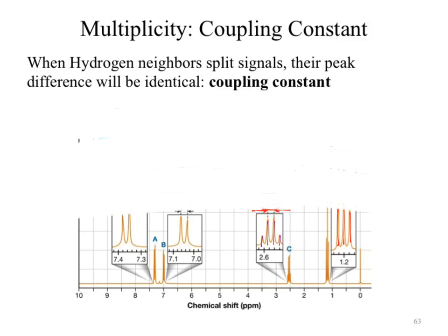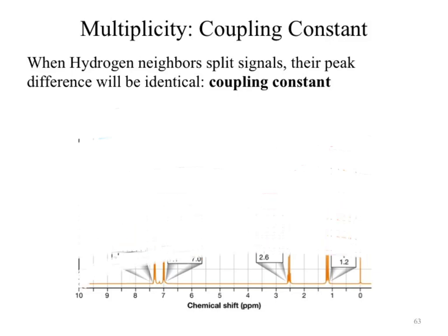Where it becomes really important is if you wanted to distinguish between, give me a sec here, erase this. What is the difference between these 2 signals? We're going to end up with the same number of signals. Actually, I need to add another carbon in there. Same number of signals. Chemical shifts, same. Integration, same. Splitting pattern, same. So how would we tell the difference between these?